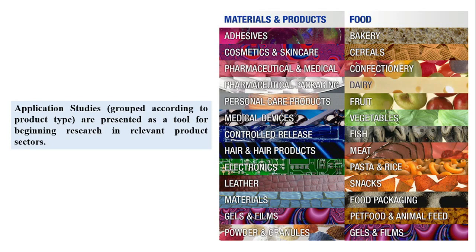These are the different sectors in which texture analysis is used very frequently. It is used for quality checking of various products such as dairy products, fruits, vegetables, personal care products, pharmaceutical and medical products, etc.